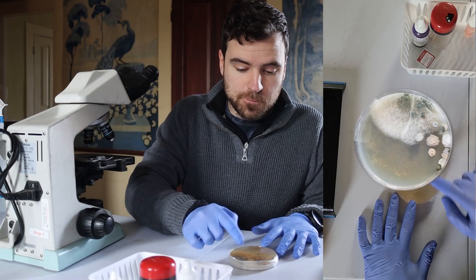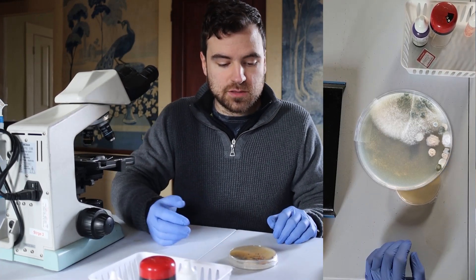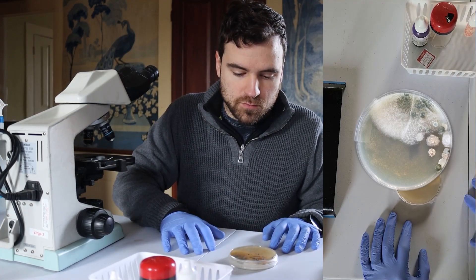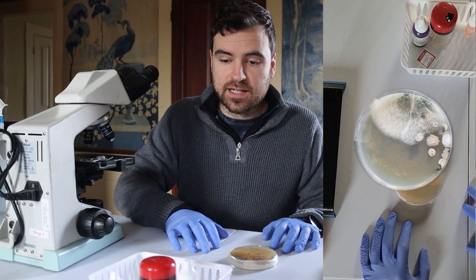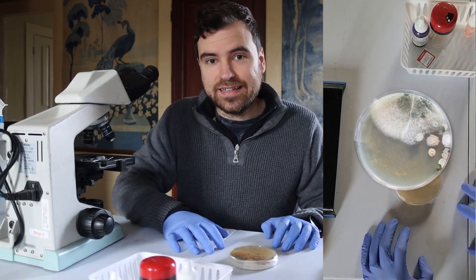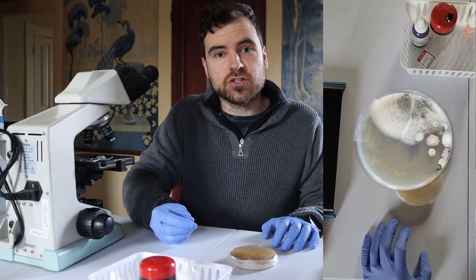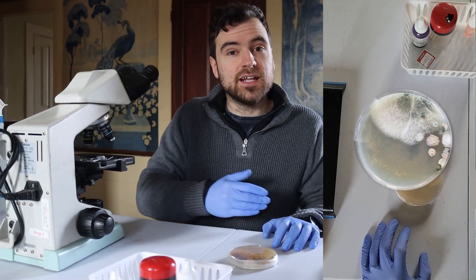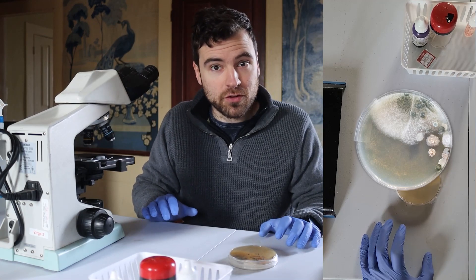Now let's say the P.O.P. Ni control had passed. What we could do is streak out the exact colony that we wanted. For simplicity, let's say this green one here is the colony we wanted. We would take a sterile needle or an inoculating loop, scratch the surface of that colony, move it to a sterile plate, and again streak for isolation — just like we did in the first part of the video.